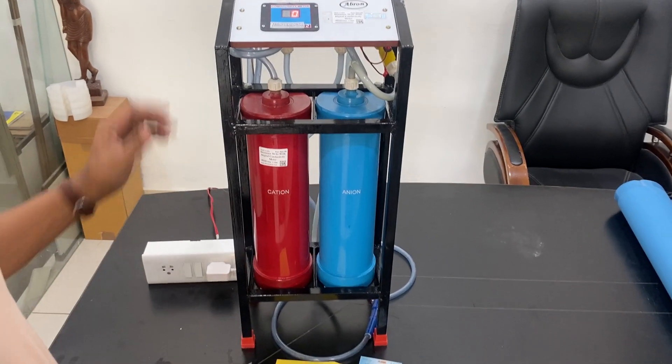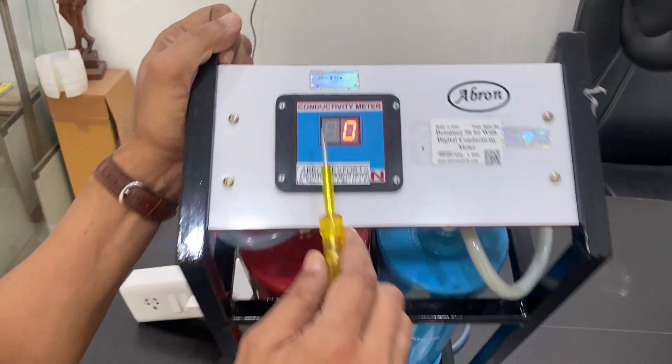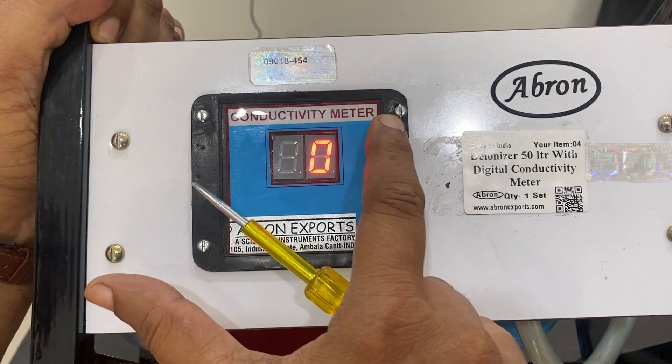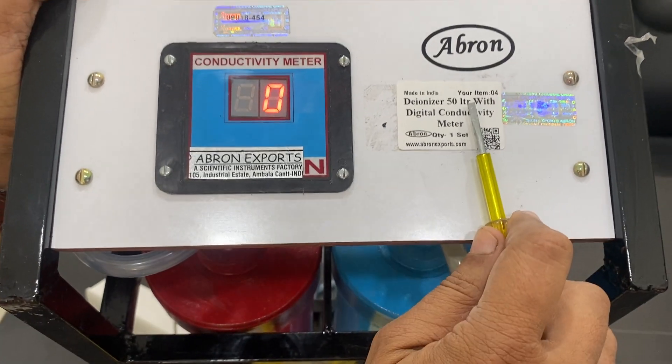This is one more video by Abron Exports for the Deionizer. This is the Deionizer. Capacity is 50 liters. It has a built-in digital conductivity meter. The flow capacity is 50 liters per hour.